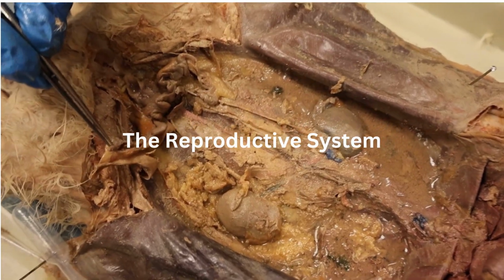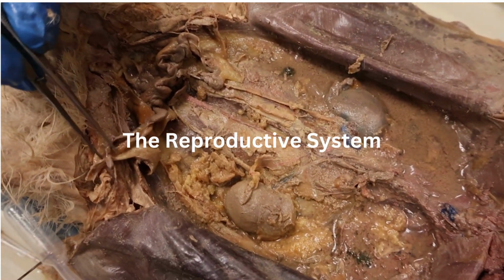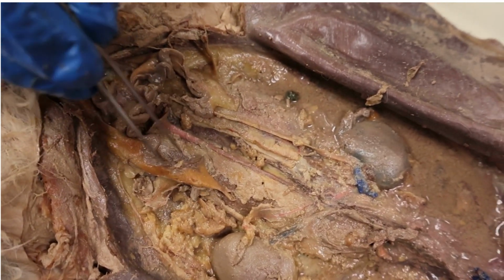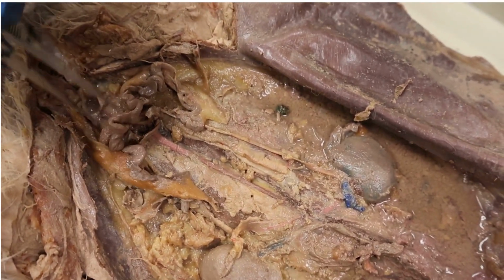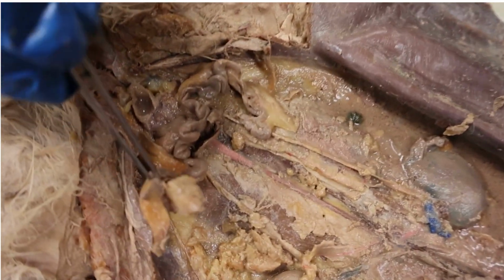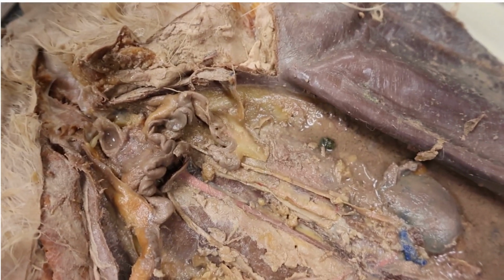So we're starting the reproductive system of a rabbit, and this is a female rabbit, and it has female gonads. As you can see, it has the ovaries, the fallopian tubes, and then the uterus. So the ovaries is where the eggs are held, and then it travels through the fallopian tubes to get to the uterus where the baby is made.